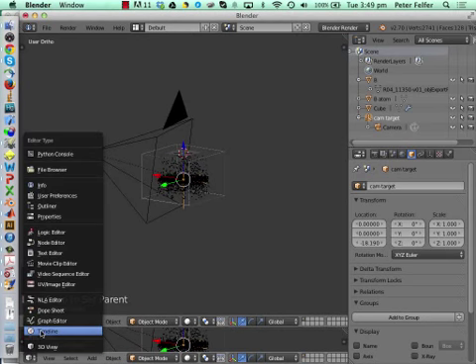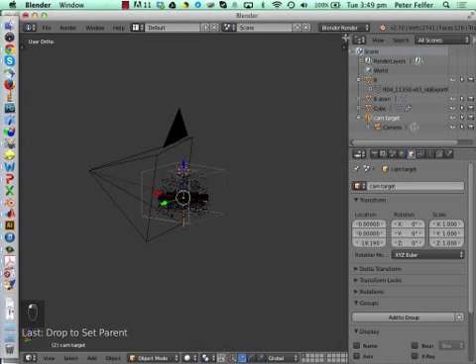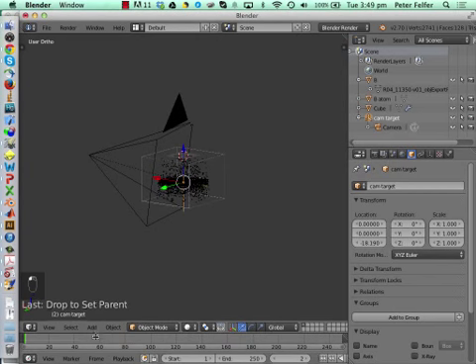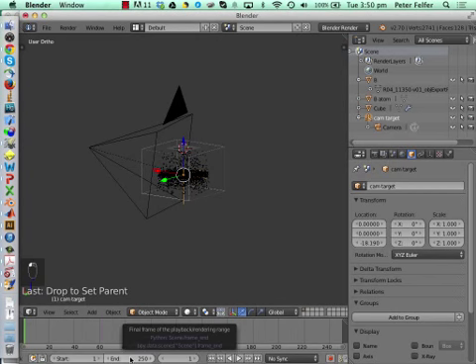So remember, we had the timeline here before. Oh, sorry, I didn't show you how to split the view. So you go here into the corner and just drag down the corner, splits the view, and change it to timeline. Get a little bit larger maybe. And scroll a bit to the right. Sorry, it's a bit crammed on the screen. Unfortunately, usually I have better resolution than that. And now we have the playhead again and everything, and we can do the animation.